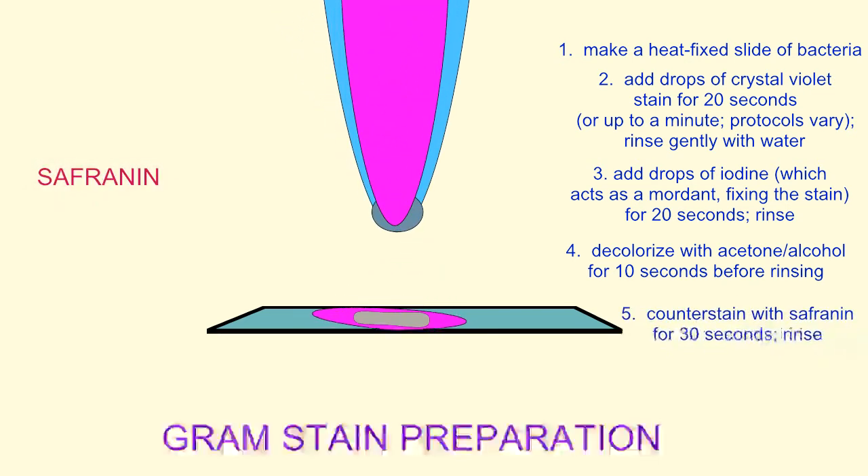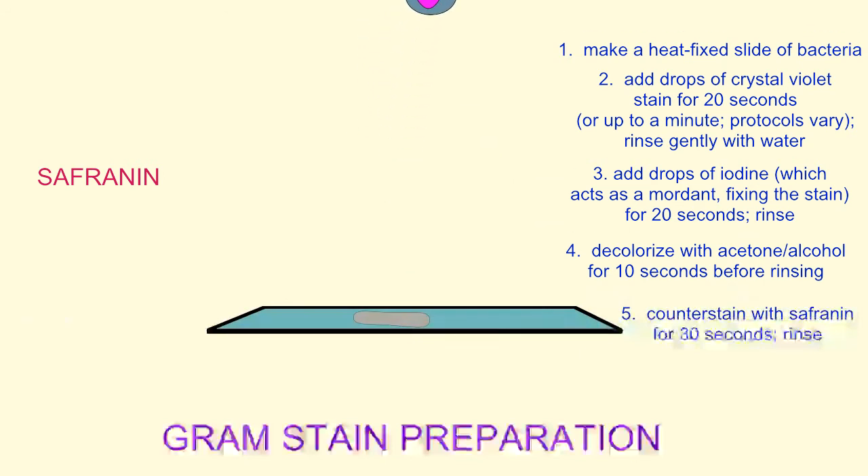Next, a few drops of the pink counterstain, safranin, are applied to the slide. This will not stain the gram-positive bacteria because of the purple crystal violet stain which has been fixed with iodine in their thick cell walls. But the newly exposed thin peptidoglycan layer in the gram-negative bacteria will stain pink with this counterstain, safranin.